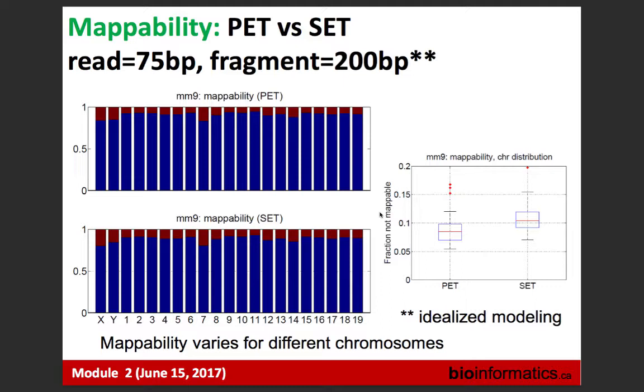And it is true on the Illumina platform that you're limited to about 600 in terms of your cluster. That's just the nature of how the clusters are formed, and also of the read length because of the phasing and prephasing problem. But you're going to go through the mapping, and yes, in the practical bit. So maybe, are we good?